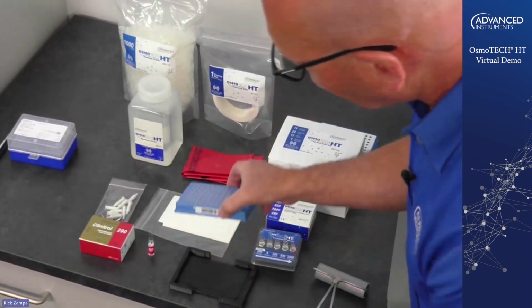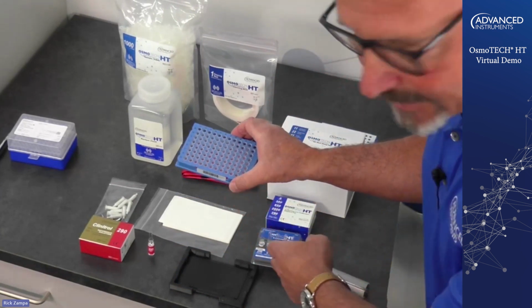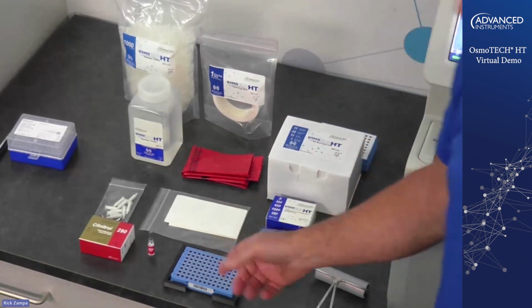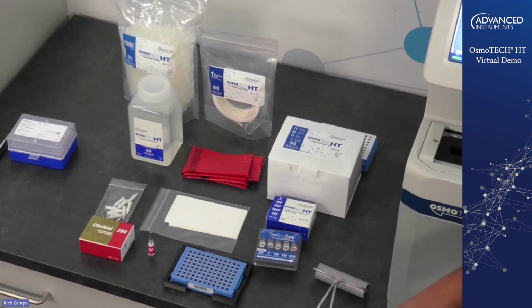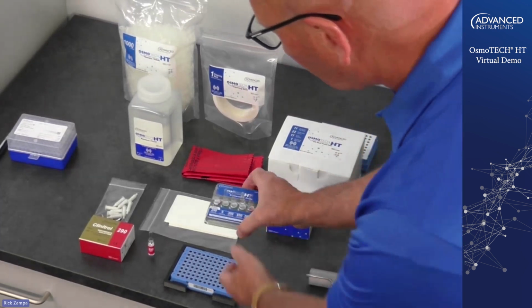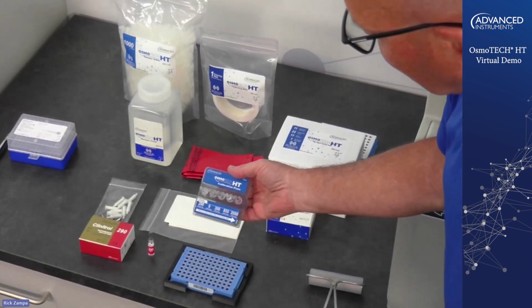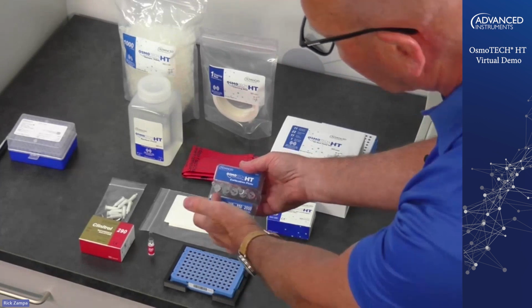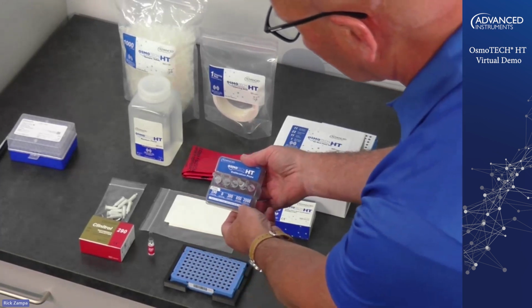These are your 96 well plates, which have a barcode on. The barcode is read every time you run the plate. That allows you to keep reusing the plate, because the instrument will remember what positions have already been used, and then you can just reuse the plate and continue to use it until you have used up all 96 wells. We also have a calibration cassette here, which is used for calibrating the instrument, and also comes with a verification position so that you can run your calibration and then run your verification right after the calibration is run.